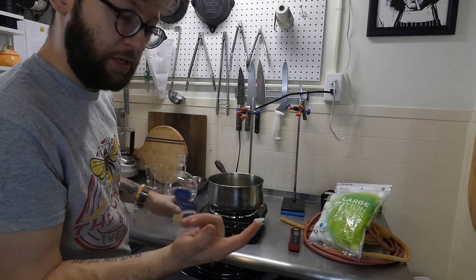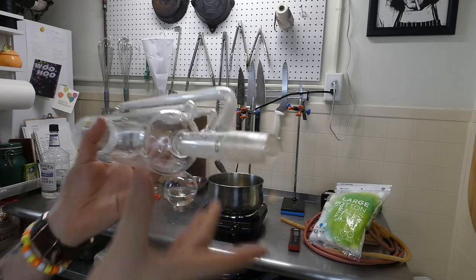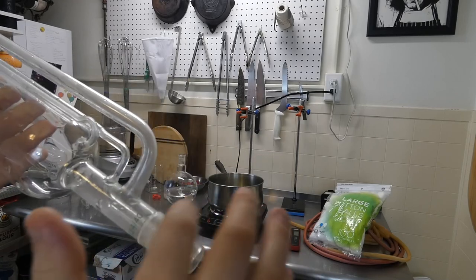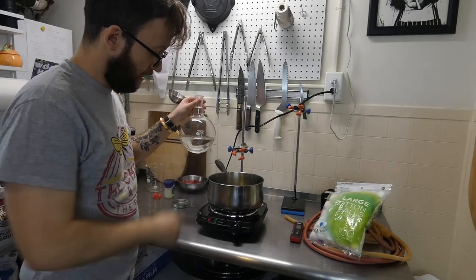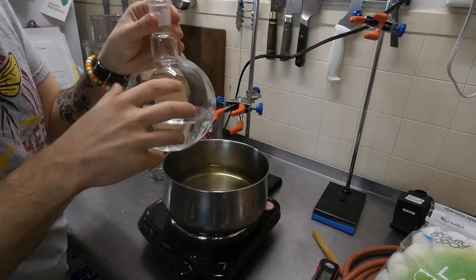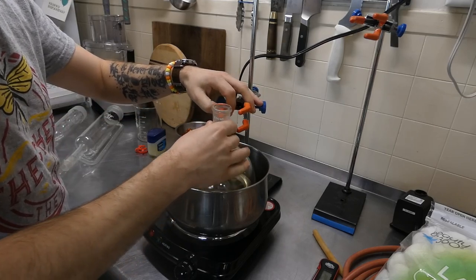So you just take a little bit of the Vaseline, take your joint, and you're just gonna rub it on the joint there and there. All right, so now that you have your joint greased up, we're gonna put this into the pot. So you're gonna take your clamp here, open it up. You're gonna take your flask, pop that in the oil there.